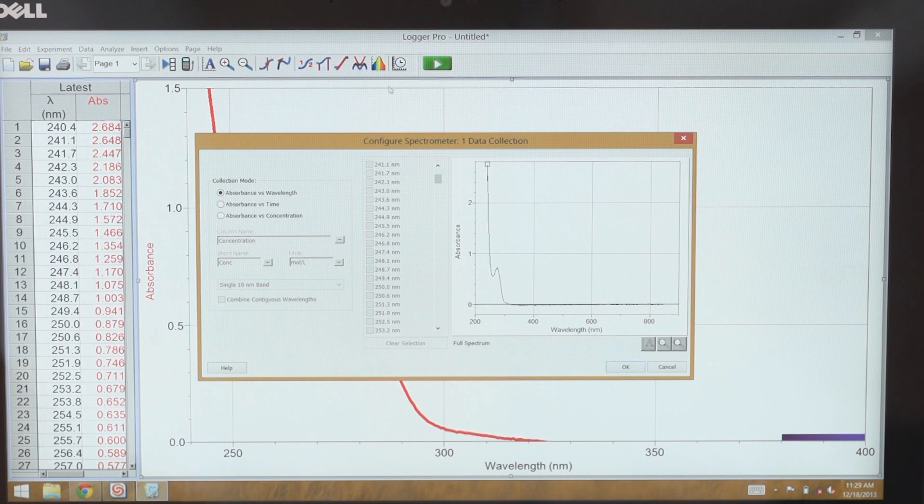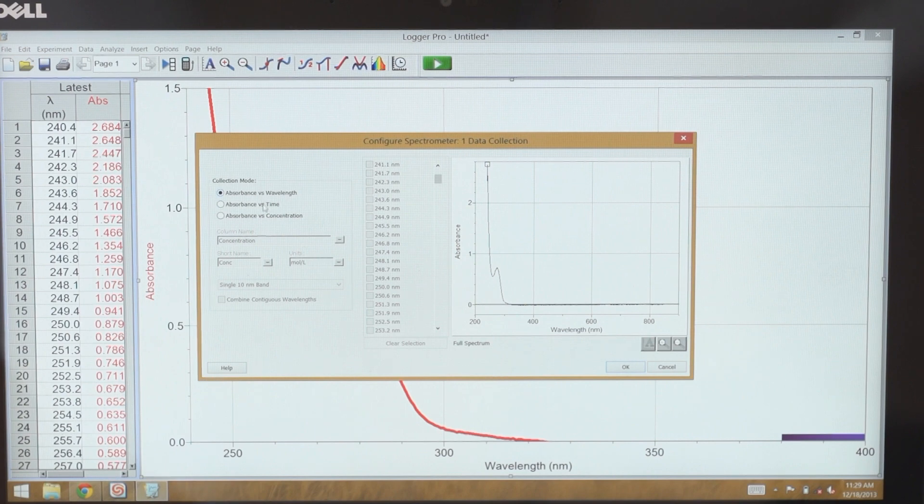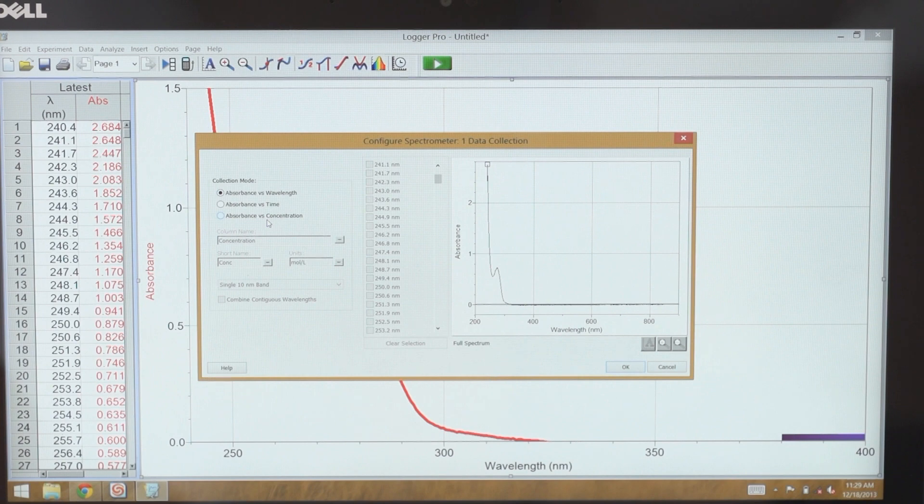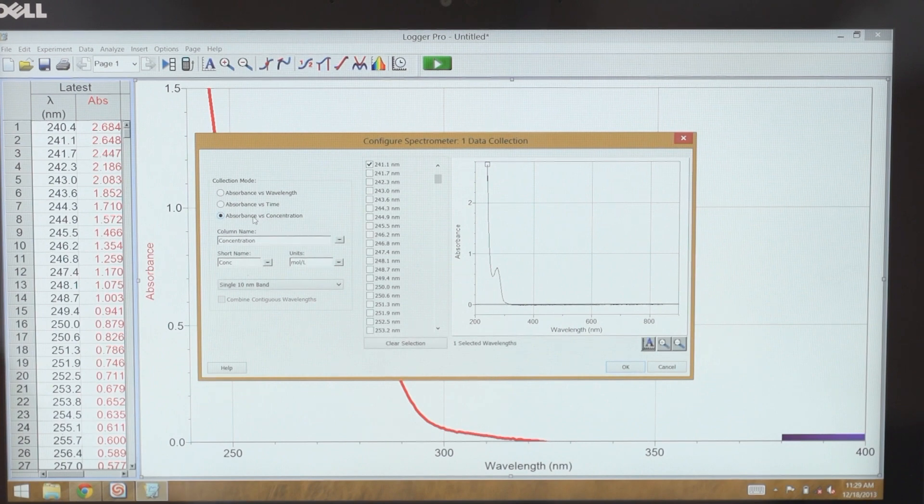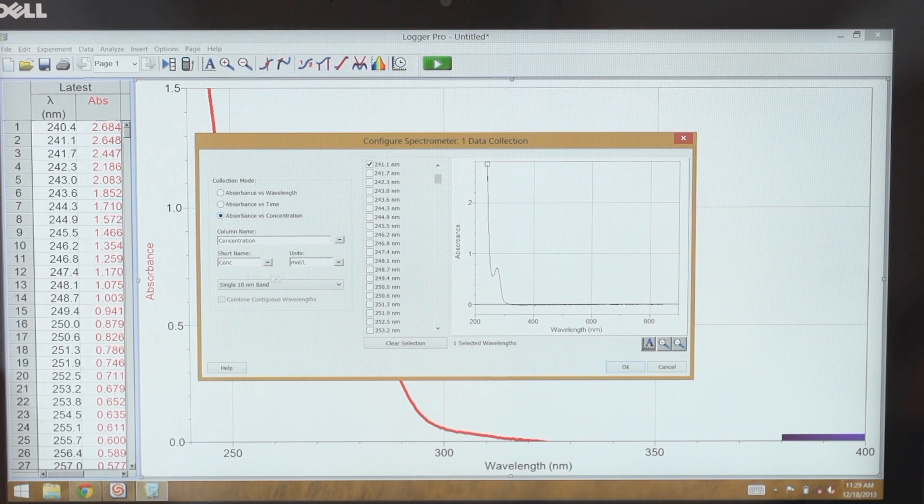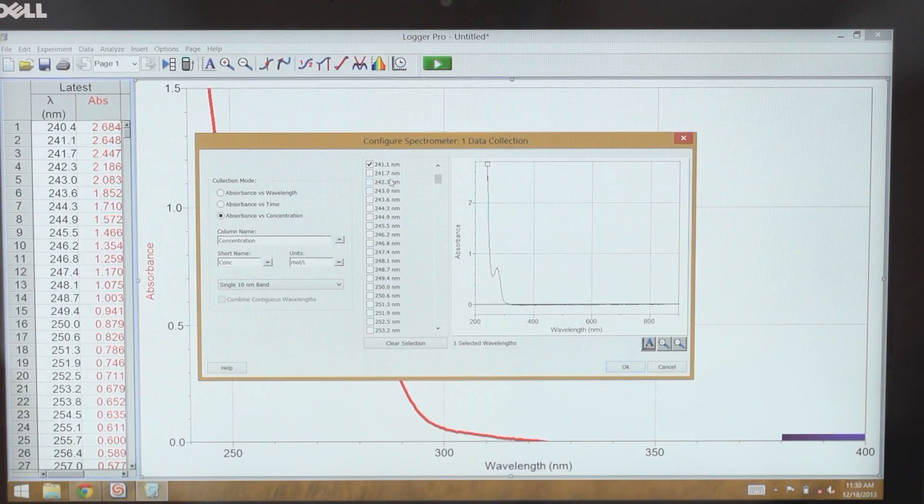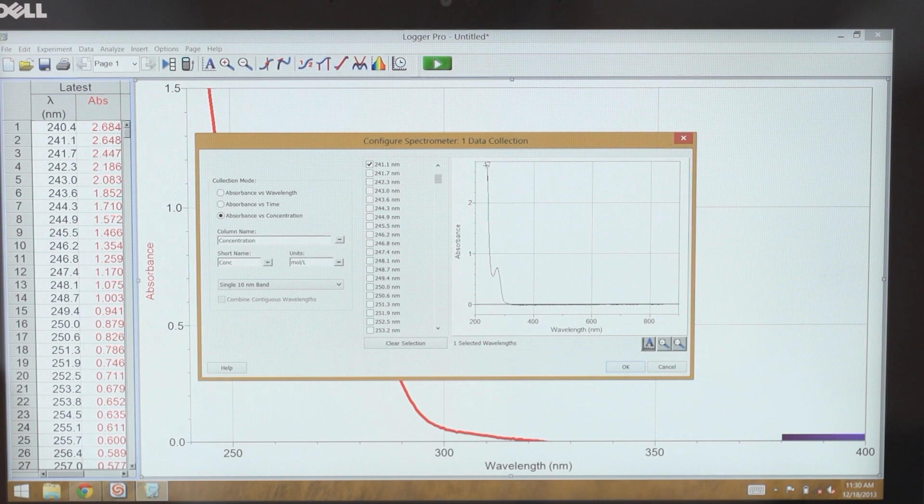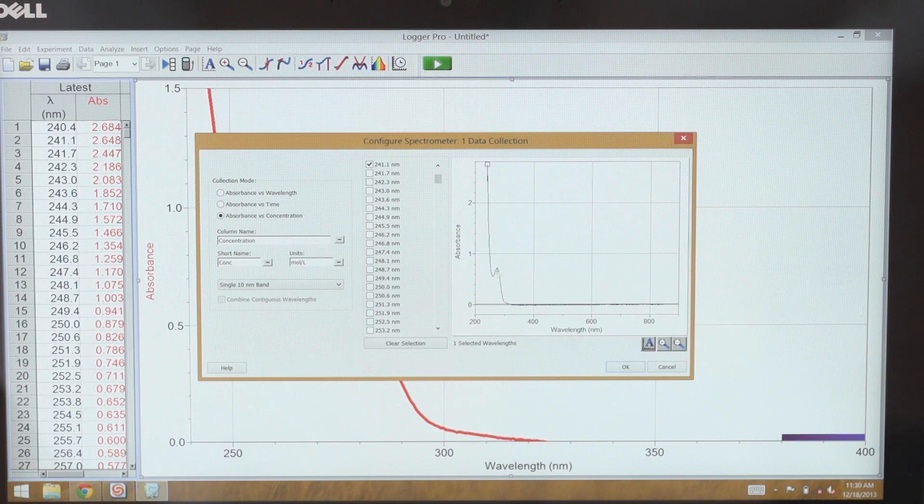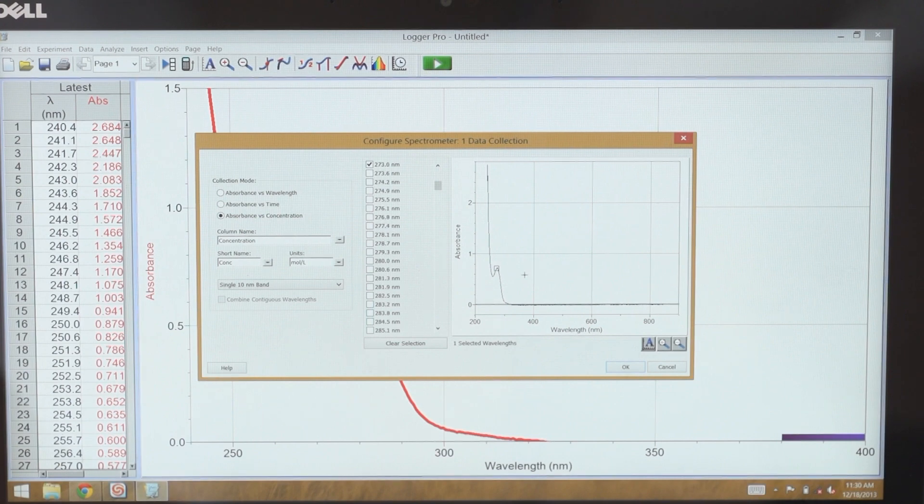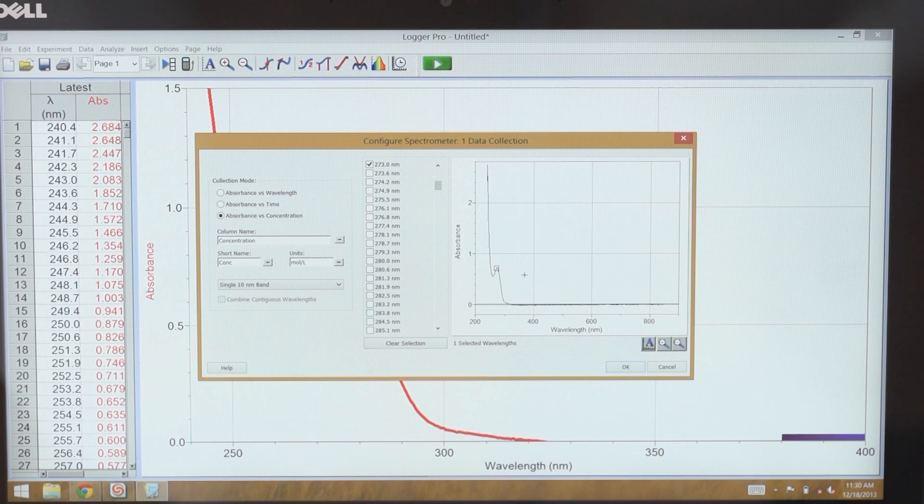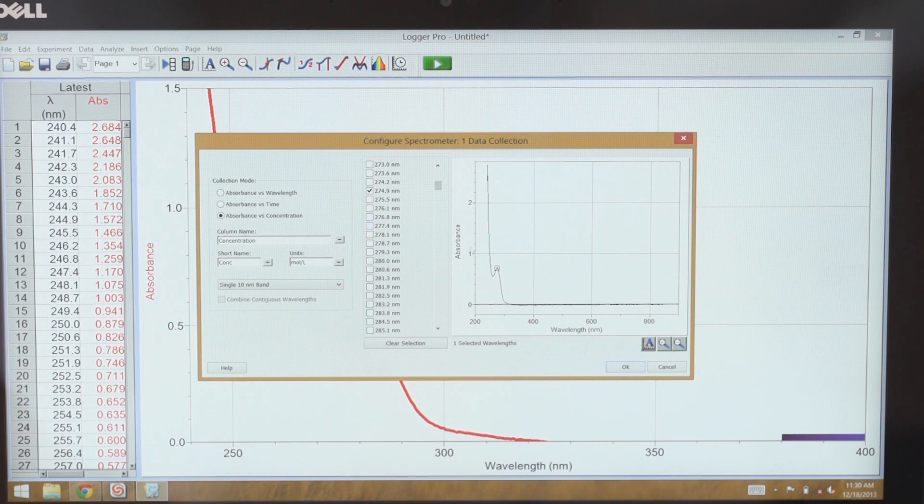It brings up this dialog box, and you can see the three different modes of data collection here. I want to select the third one, absorbance versus concentration, where the column name and units are already filled in. You can edit these fields if you like. The wavelength that is first selected is automatically going to be the highest absorbing wavelength. For this experiment, we don't want to use that. We actually want to use this peak in here. So I can select that peak either by tapping on the graph or by manually choosing from the list of wavelengths. And then I select OK.